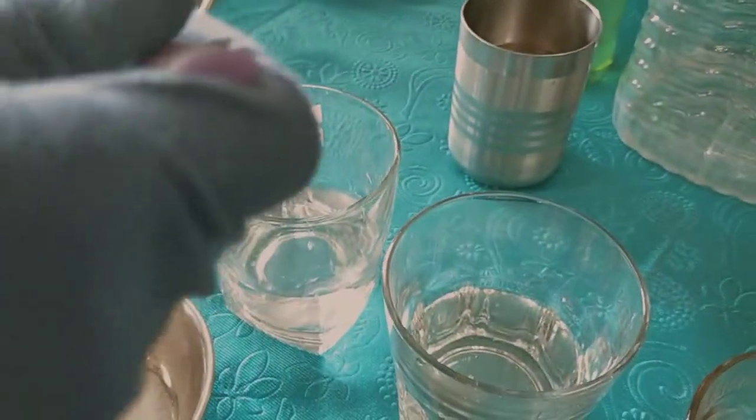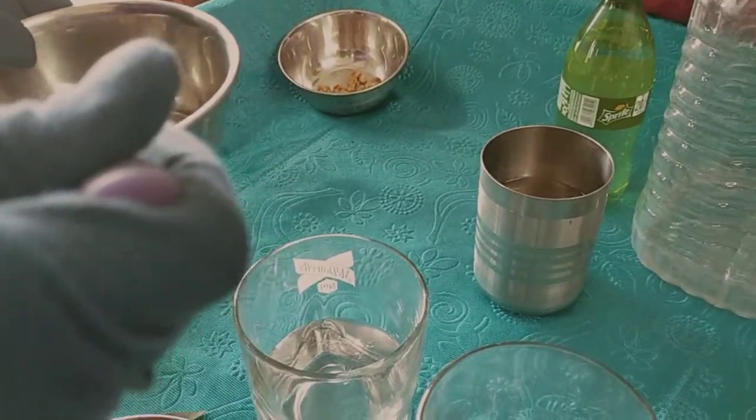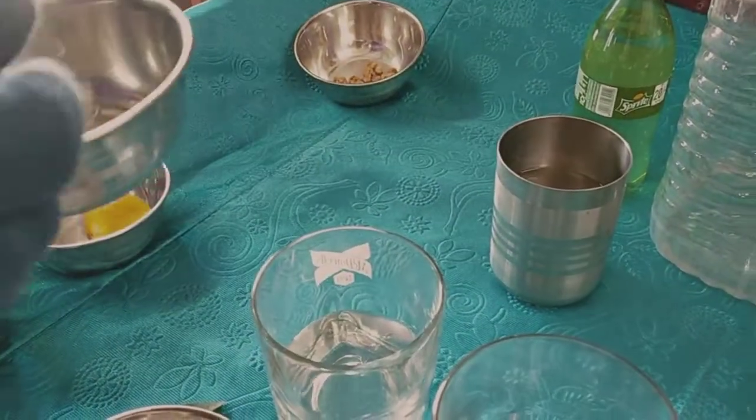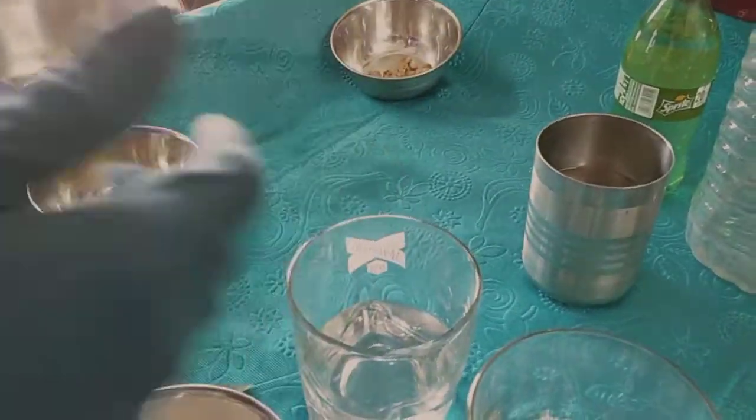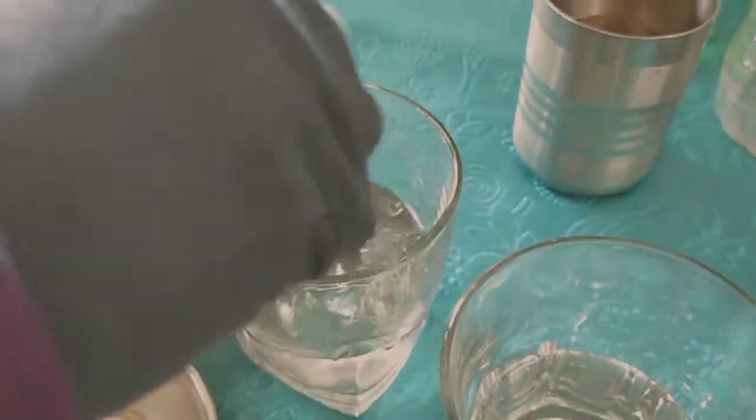Now you take a little solute. Always take a small quantity. Solvent will be more quantity. Always remember, solute will be small quantity, solvent will be more quantity. Now take this solute. Add in this. Okay, mix.